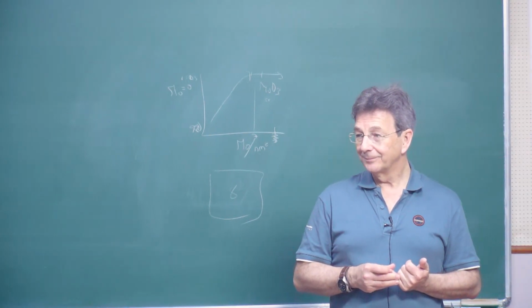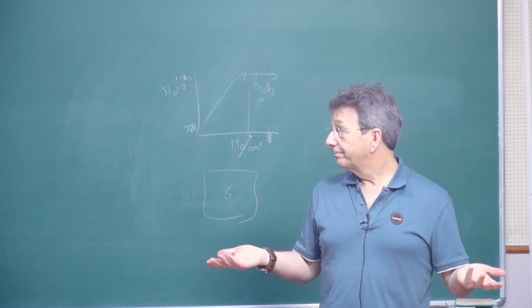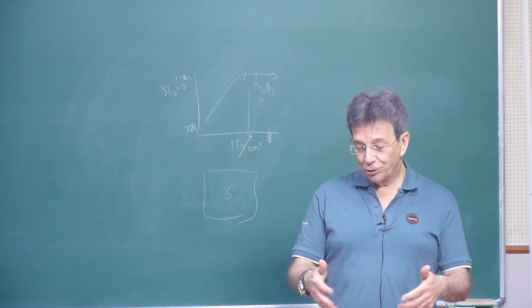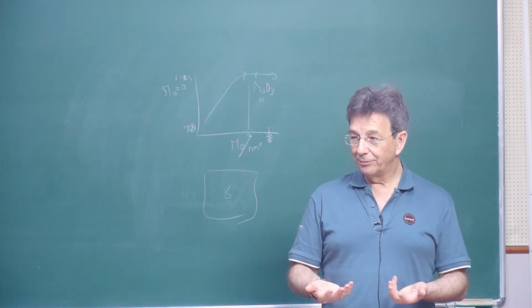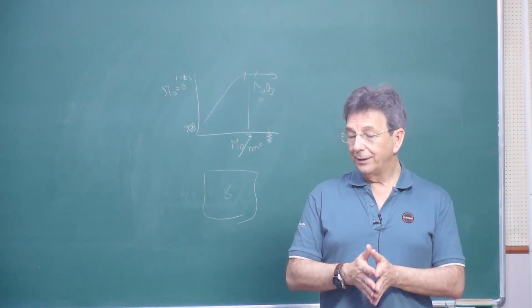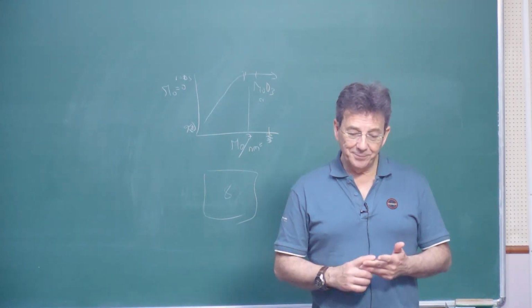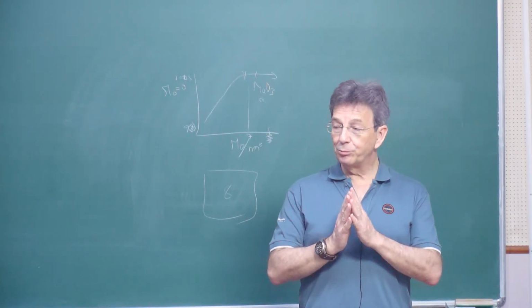So what is the typical particle size of this? You don't really have a limitation in the particle size, because Raman, as long as you have a molecular structure, it will be reporting about it. If you have a large crystal or a nano crystal, it will report. Of course, when you are dealing with a nano crystal, it will probably be more defective, which means that probably the Raman bands will be broader.